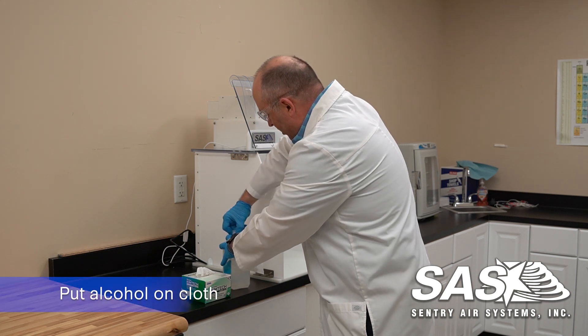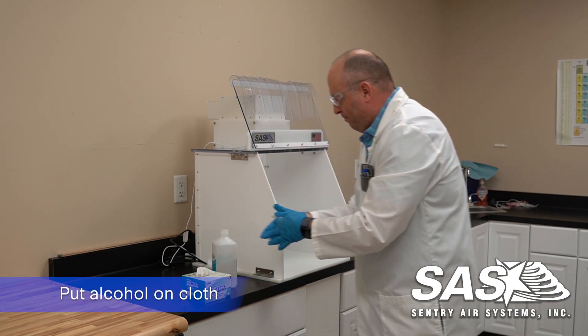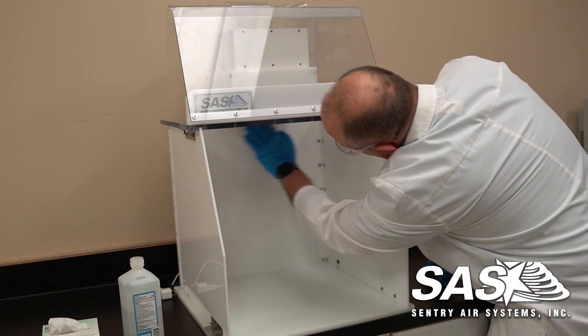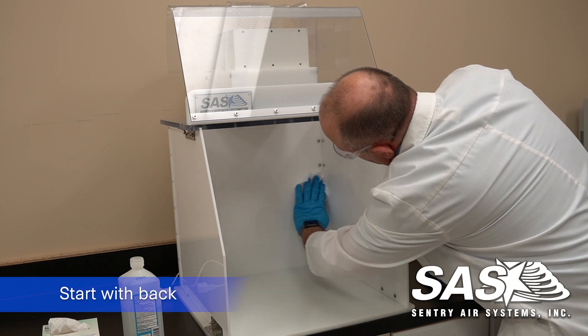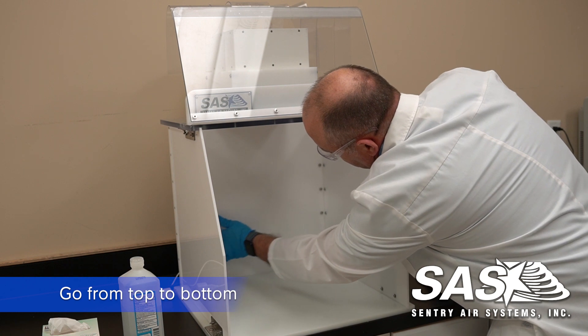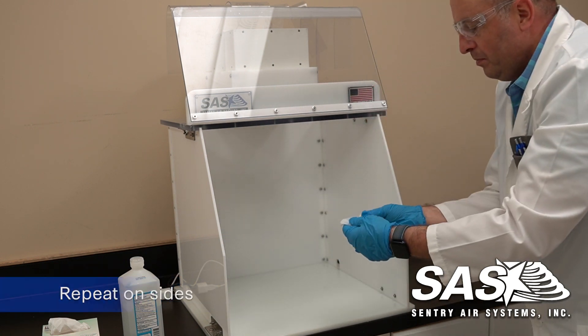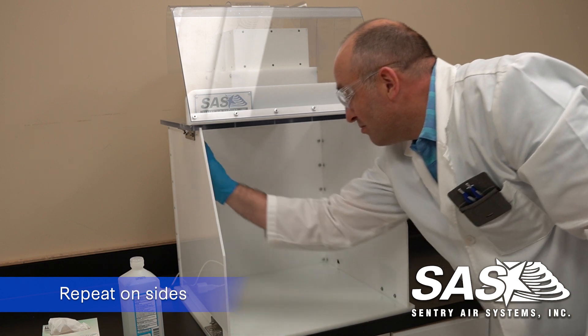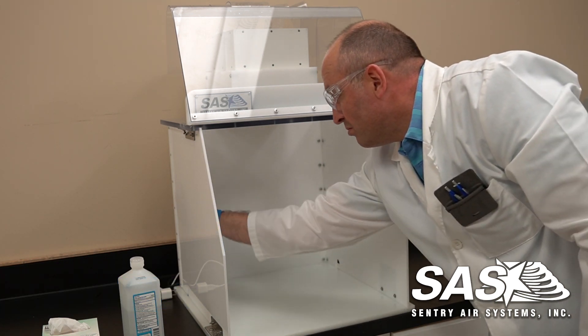We'll take our alcohol and start at the top of the back wall. Go side to side and work your way down with overlapping wipes, all the way down to the bottom. Then move over to the side. Same process — start at the top, go side to side, and work your way down.